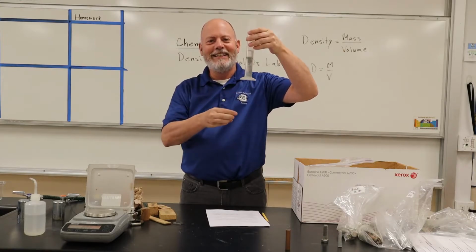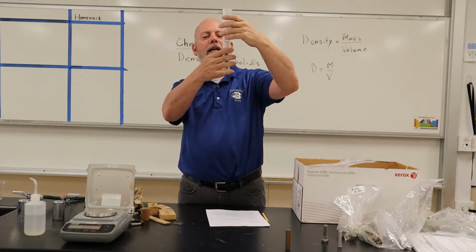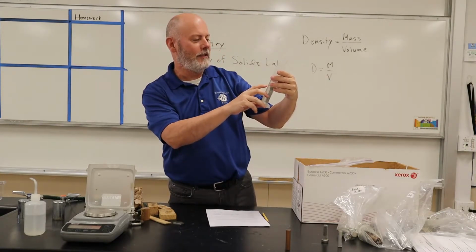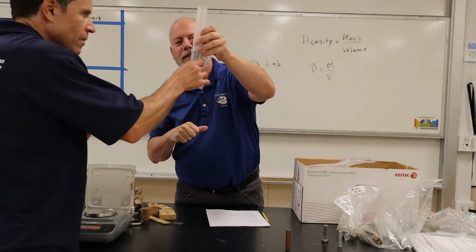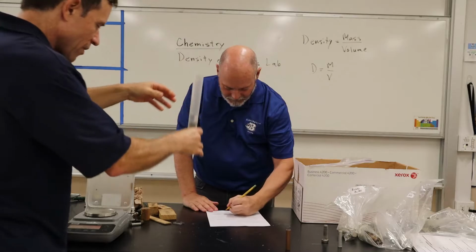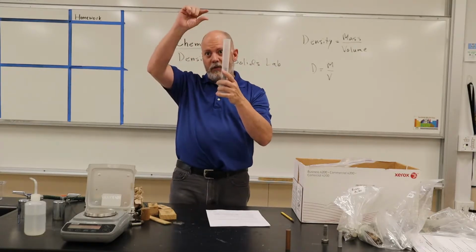Man, now I have a little more respect for when the students do it. Okay, all right, I got this. It's the clear plastic that's coming out. Maybe 10, 20, 30, 40. 44? Can you verify that? Oh no, it's way up here, I'm sorry. It's like 55. Yeah, 55. So it went from 46.5 to 55. So there's the volume.